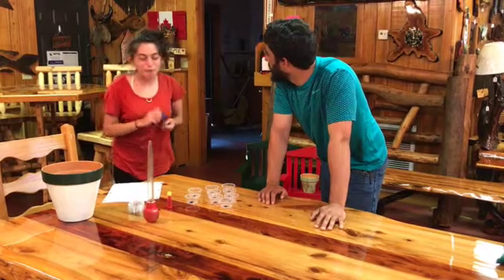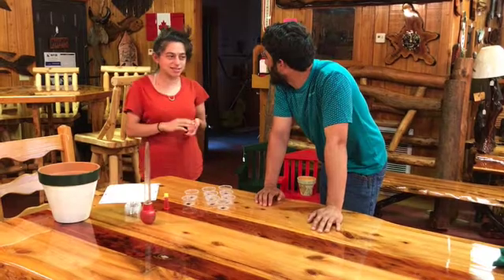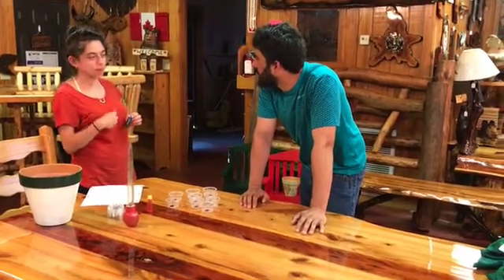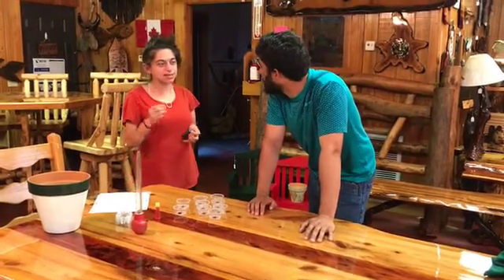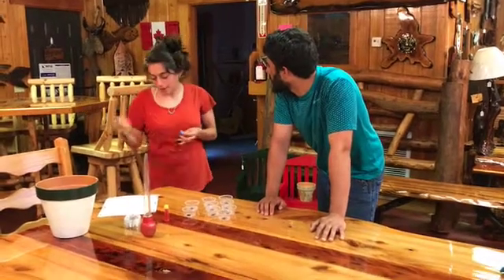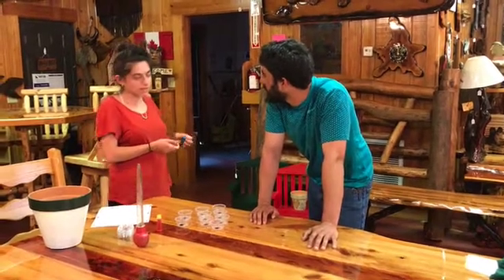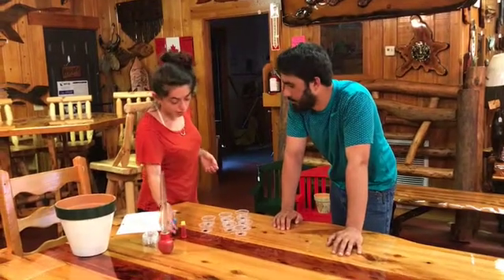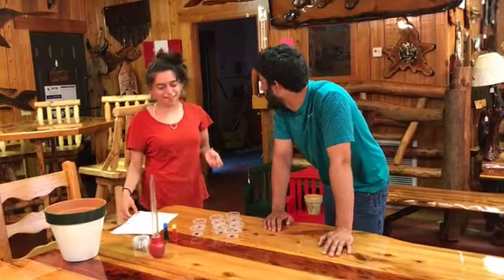No, Coomassie dye. Certain amino acids on a protein will react with the dye and allow the protein to absorb blue light, because normally we can't see proteins. But this dye attaches to the amino acid side chains and lets it absorb blue light. And so the more protein that's present, the more blue the sample will appear, and ones that don't have a lot will turn brown. So the more the bluer. Yes.